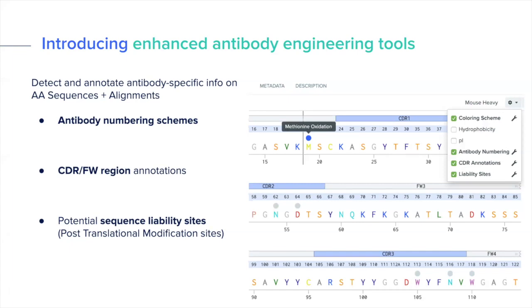There was a question about bulk assembly with HCs and LCs to be considered together. Bulk assembly right now is primarily for assembling DNA constructs and not protein sequences. I can add some color there, though.